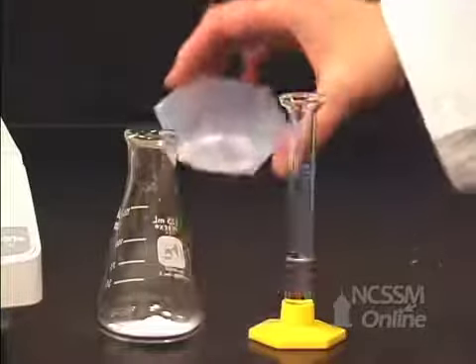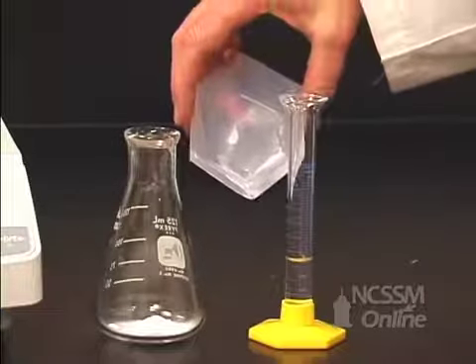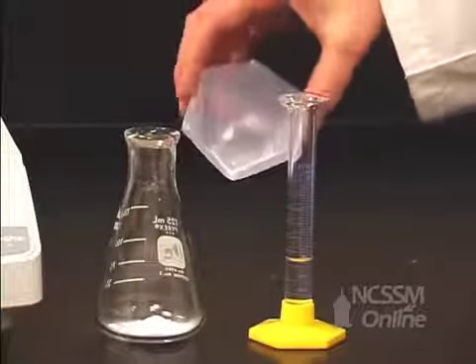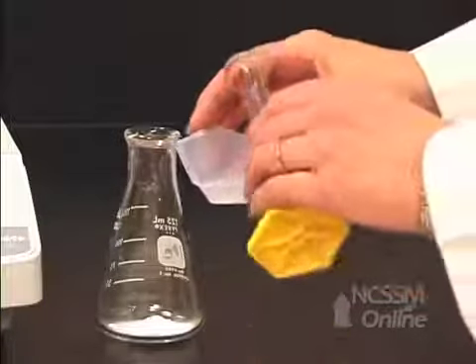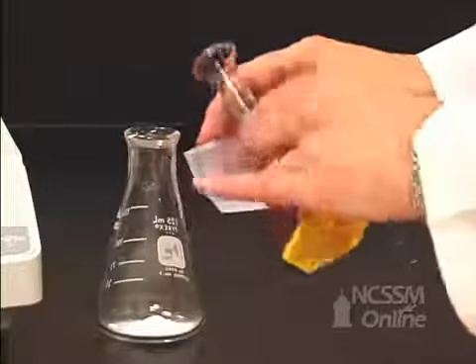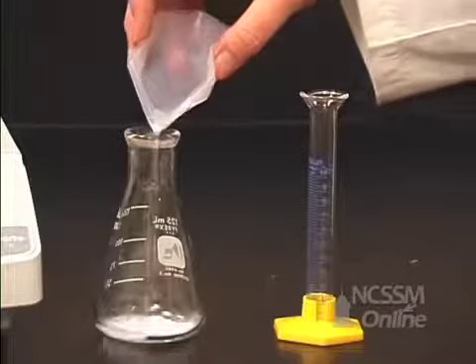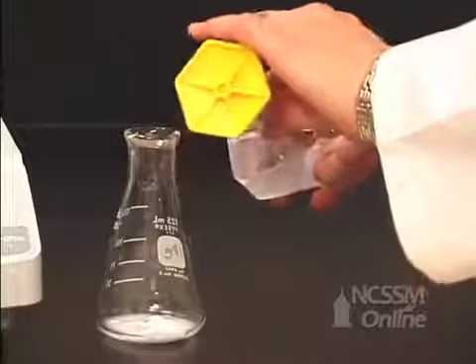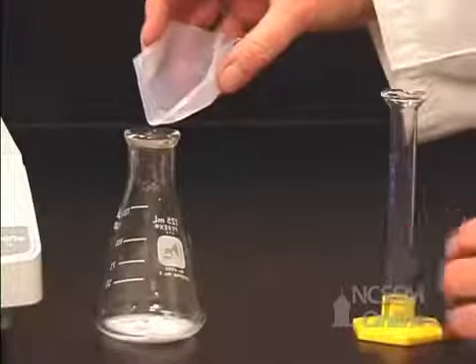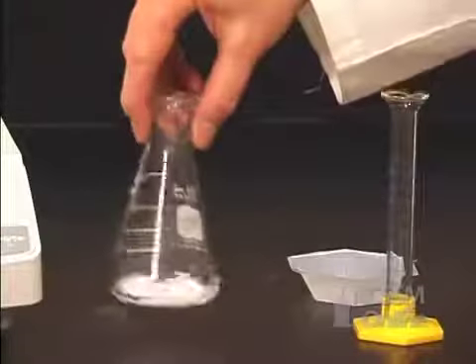As you can see, there's a little of our salicylic acid in our weigh boat. So in order to make sure we get it all in there, I'm going to pour the acetic anhydride here, swirl it around a bit, and then get all of it in my Erlenmeyer. And I want to mix.